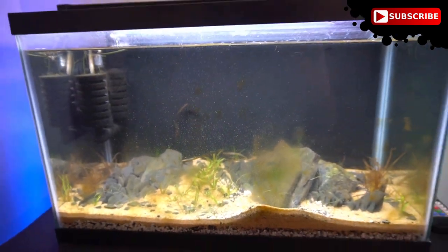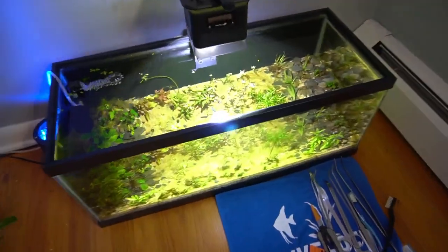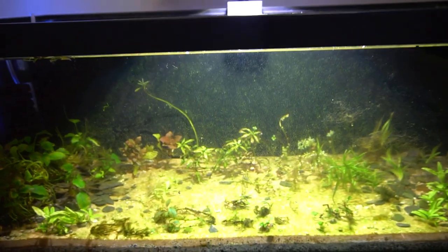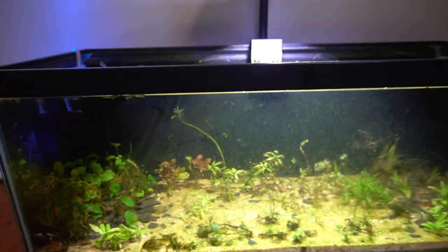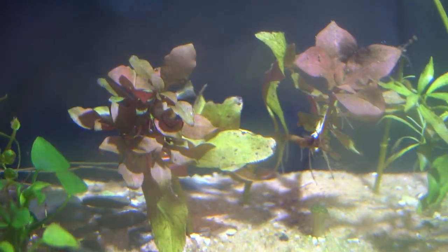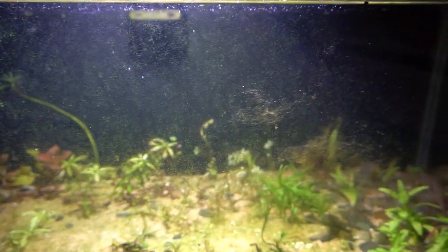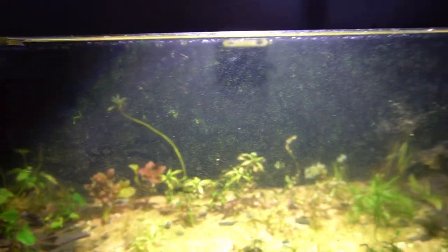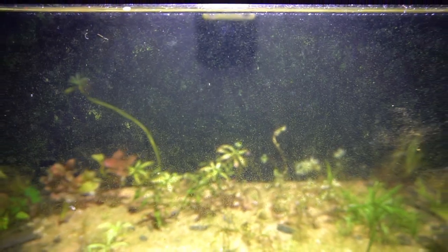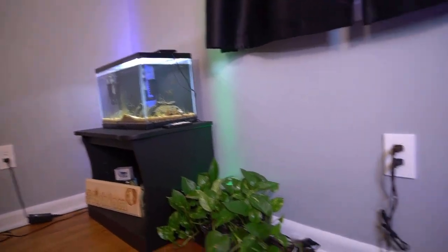I wanna take a look at this tank under the microscope. The second tank we're gonna look at is this plant quarantine tank that I put together here in my office as well. They've got a pretty heavy-duty light on it, so all that light is definitely causing some algae — I expected this. It's a new tank. There's shrimp in here, some neocaridina red cherry shrimp, as well as some ram's horn snails. You can see all of the green algae there on the glass. We're gonna take a look at some of that under the microscope as well.